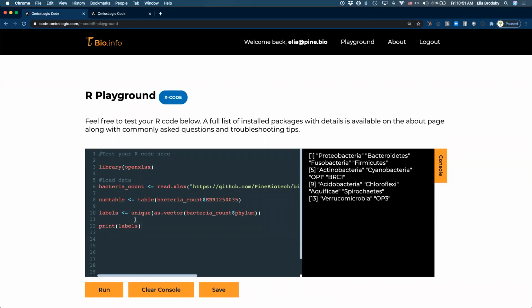Once we've got these labels, we do want to save how many of these labels we have. So the easy way to do this is to save it in a variable. If you have any challenges, just let me know. How do we actually create a variable?